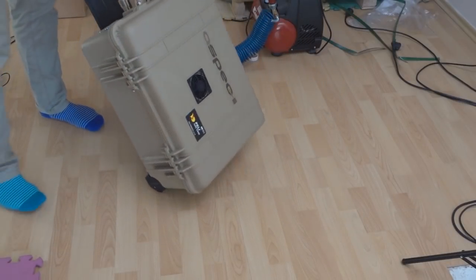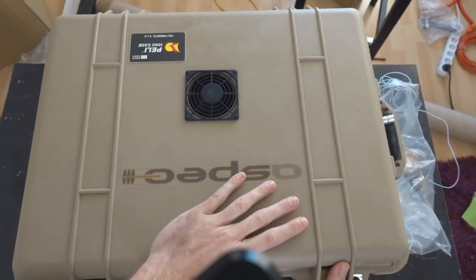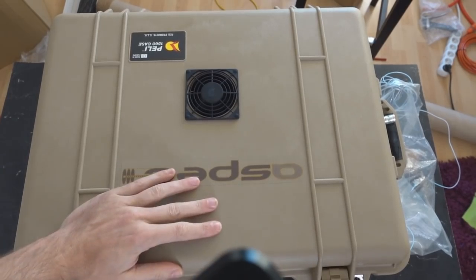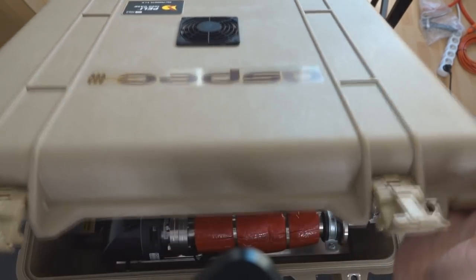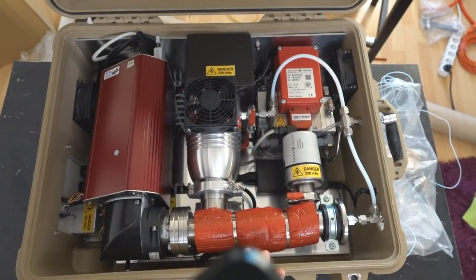It'll actually all just wheel around. So what could possibly cost that much money in a suitcase? What does it look like on the inside? So we open this guy up and instantly it looks like something that a terrorist might have in a Hollywood movie.